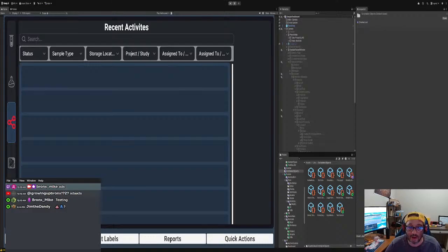We're gonna have, well, how we're gonna initialize it. We're gonna say, give it a name, priority, critical is false, but I set it to true because we do need it. Critical just means try again and again and again several times. If it isn't critical, then we just skip it. And then we get the catalog async, right? Which is, I'm gonna stress this, the actual query to the table that we need, which is the test table, right?